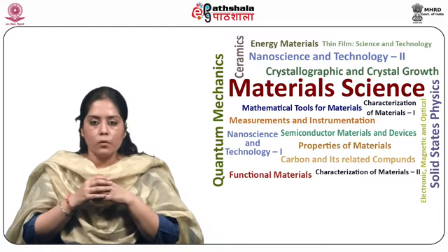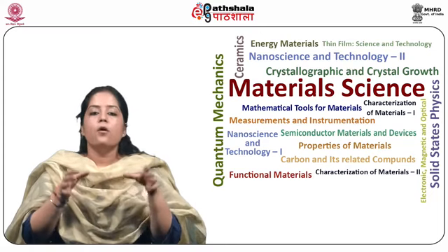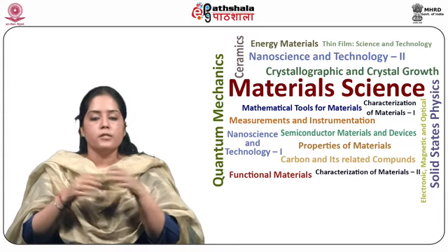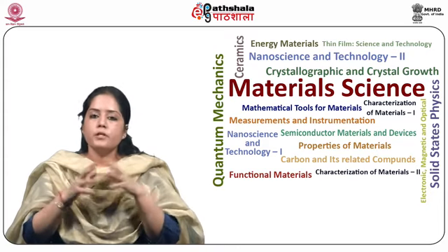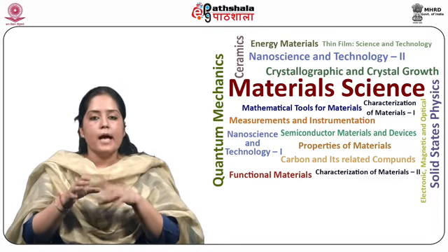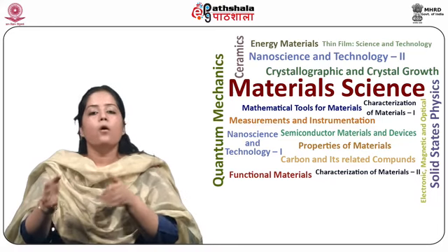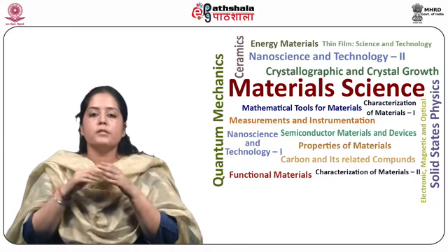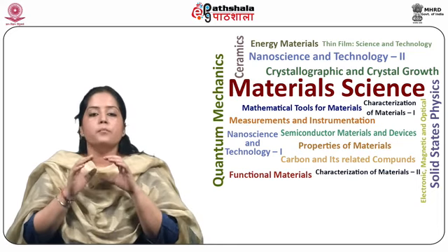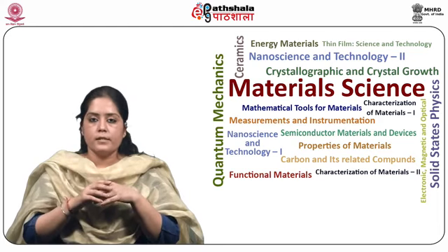Spectroscopy involves investigating the interaction of electromagnetic field with matter. Spectroscopic data is represented as an emission spectrum of wavelength or frequency-dependent response. Spectroscopy can be broadly classified into two categories.